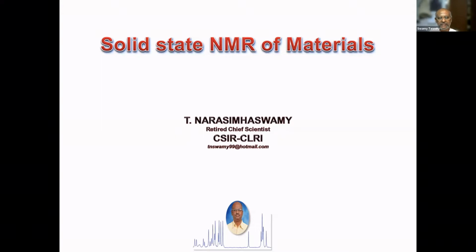I have been using solid-state NMR right from the 1990s. So the advancement in solid-state NMR is breathtaking. Solution NMR has played an important role in many areas of research: physics for developing the new pulse techniques, chemistry for routine. Synthetic chemists cannot dream of their research without solution NMR. In material science, especially when you have an amorphous material or cross-linked systems, solid-state NMR comes into the picture. In biology, today, one of the most active areas of solid-state NMR is biology.